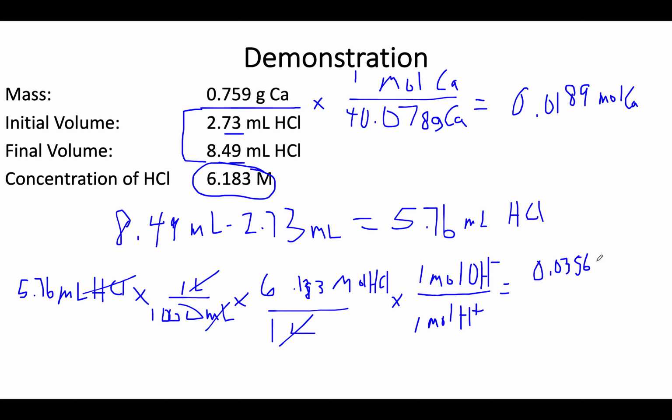Okay, and remember, what's the goal? Again, we know the answer, possibly, for the ratio of hydroxides to calcium, but we want to find it from the calculations, find it from the experimental work, and now we can see that the ratio here, moles of hydroxide to moles of calcium, is 1.88.